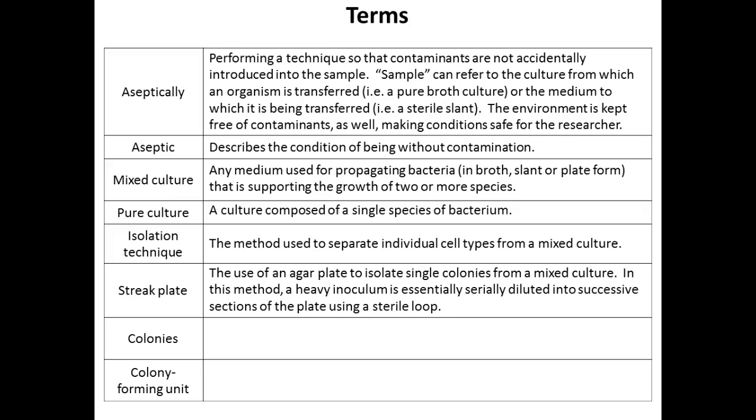Colonies are visible growths on solid media, typically a plate because you have the most room for them to spread out. A single colony, if it arose from a single organism or more than one organism of the same species, is said to be pure. But we don't always know when you're looking at that plate. The only reason you would maybe be able to know that those are hopefully pure cultures is because it says just one name on it, doesn't say a mix. And if you look at the morphologies, they're pretty much the same.